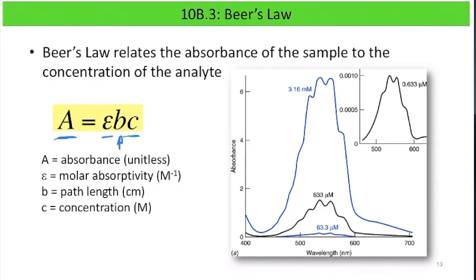of that particular cuvette. So the graph on the right just shows you how different concentrations of a specific analyte will show up on an absorbance spectrum. So an absorbance spectrum is a graph that relates absorbance on the y-axis to wavelength on the x-axis. So you can see here that this particular analyte doesn't really absorb anything on the extremes, so say between 400 and 475 and between 600 and 700, because we don't have much of a signal. You can look at the blue line to get the best example of what I'm talking about. So if we use a different wavelength, say one of these wavelengths up here, so that's somewhere around, say, 510 or 520, that particular wavelength is giving us the biggest signal because this particular analyte absorbs most light at that particular wavelength.